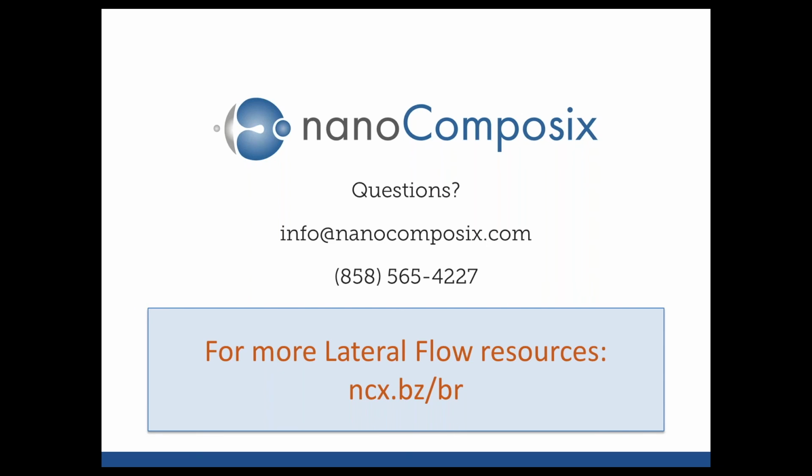Okay, thank you, Jean. This question comes from Keith. How do you control or monitor the stability of additives such as surfactants or salts on the lateral flow material? There's a couple of ways to tell if your conjugate is losing stability. Often when the particles are aggregating together, you can visibly see a change in color. The optical density of the solution will drop, and if you have access to a UV-vis, you can see an elevated baseline and a broadening of the UV-vis spectra, which is indicative of particle aggregation. Another metric is DLS, measuring the hydrodynamic diameter of the conjugate. But the quickest and easiest way to tell is simply by looking at them in solution.